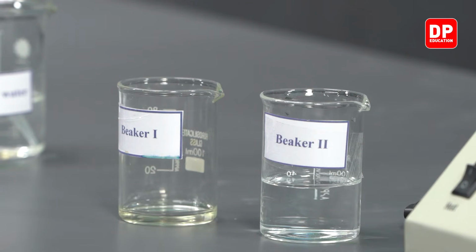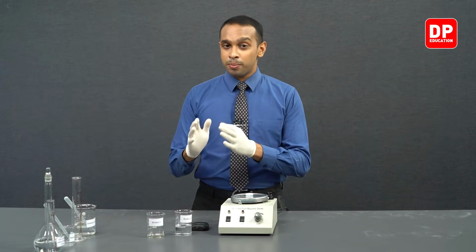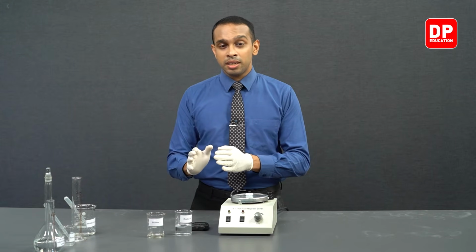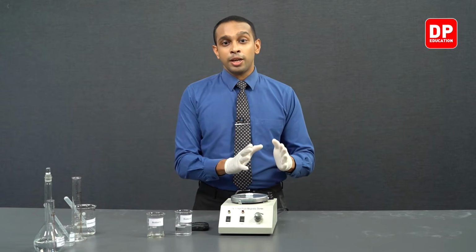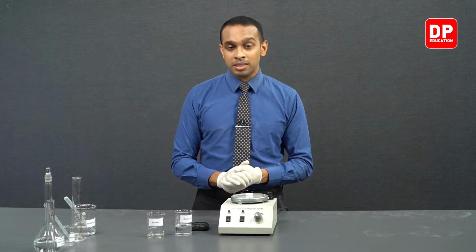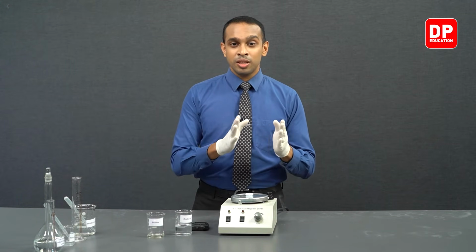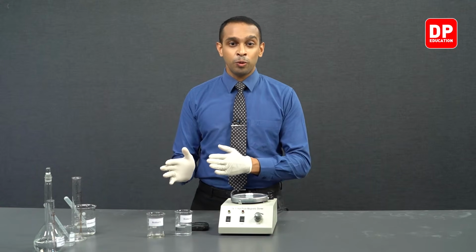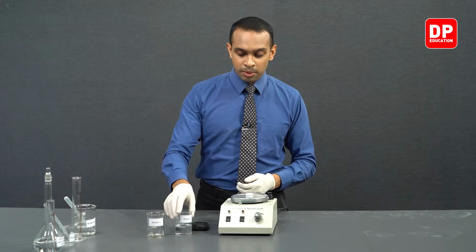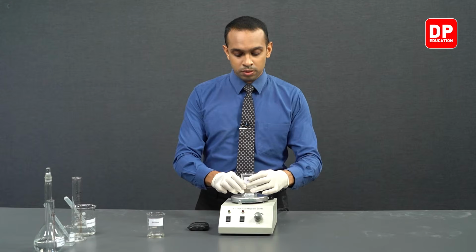So students, in summary, since the amount of thiosulfate ions present in the medium is more than sufficient to react entirely with the I2 that is going to be produced when these two reagents are mixed, we will not see a color change. So in this case, the produced I2 runs out before we run out of thiosulfate ions. While keeping that in mind, we will move on to this reaction.